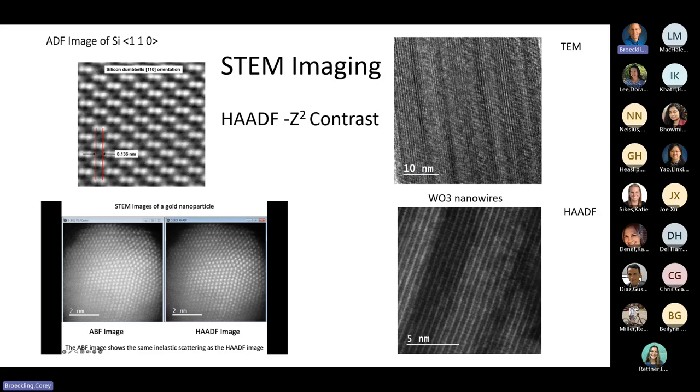Here's some STEM imaging now. All that was TEM, this is STEM. So here we have a silicon structure that's oriented to 110. When you see that, you can actually see the silicon dumbbells here. This is a criterion that people use for resolution in STEM. You can see this is 1.36 angstroms spacing. So that's actually pretty small.